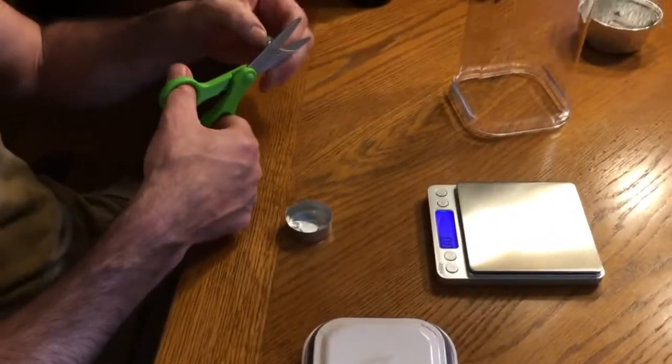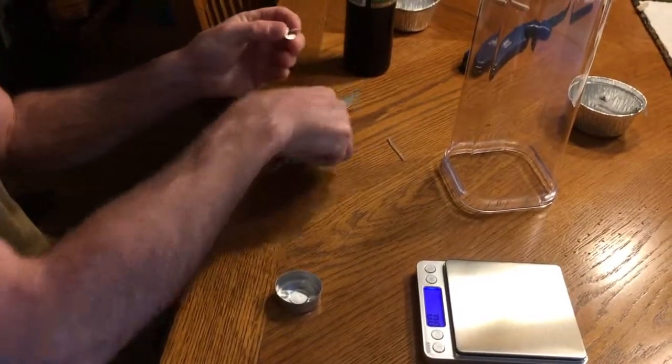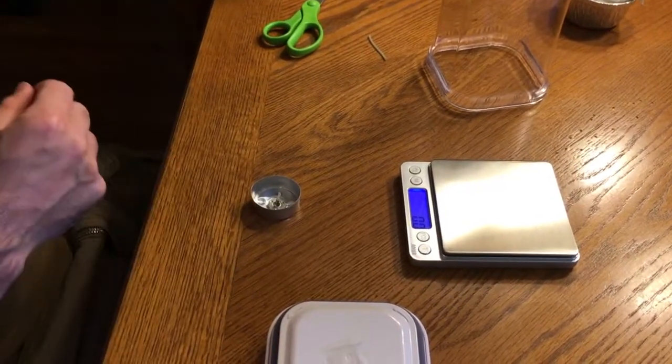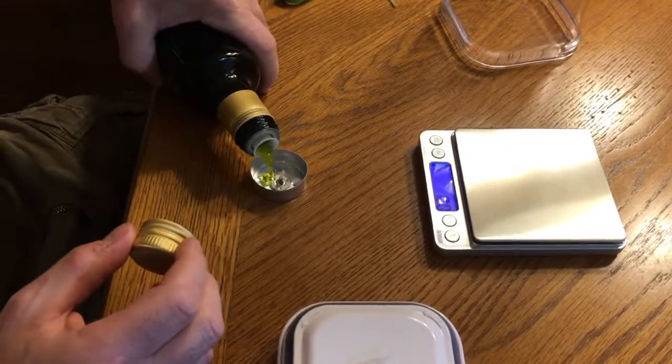So cutting wicks, you want to leave about half an inch on them and place that in the bottom of one of the tea candle containers. Put a little olive oil in — you want it to cover the bottom of the wick.